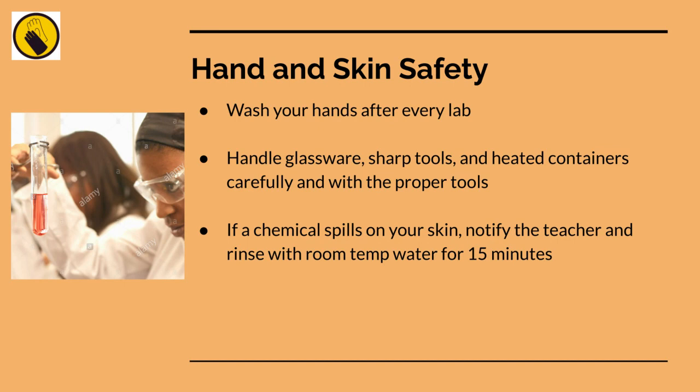There's all kinds of protective wear that you can use in order to pick up heated materials, glass materials, and in order to stay as safe as possible. Now, let's say something does spill on your hand, you've got to let me know. Again, even if it's, say, Kool-Aid, you've got to let me know. Just say, hey, Mr. Sheeline, I spilled some Kool-Aid. I'm going to go wash it off. It's as easy as that.